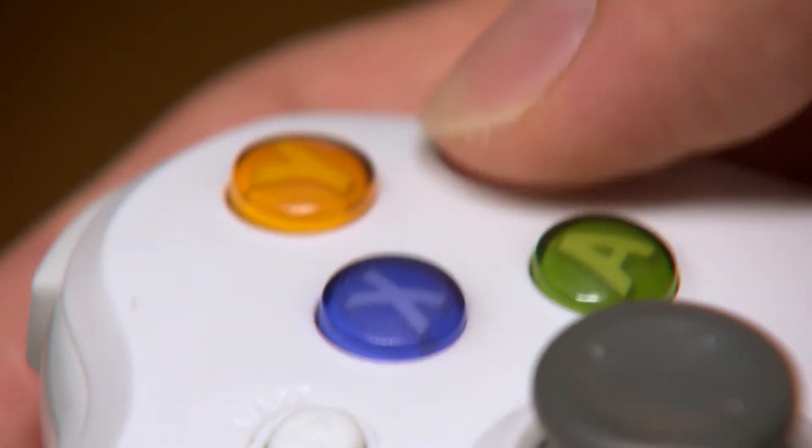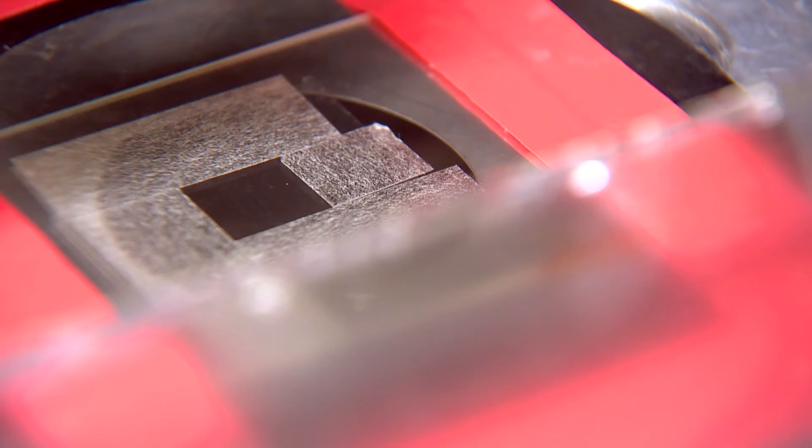The process starts right here, just a video game controller. Yonghui pulls up a grayscale digital image. That image is shot through this projector, bounces off thousands of micro-mirrors, through UV light which heats and cures a biocompatible liquid developed right here in this lab.